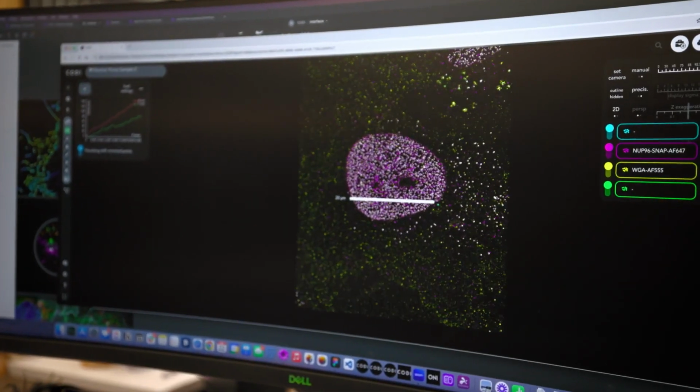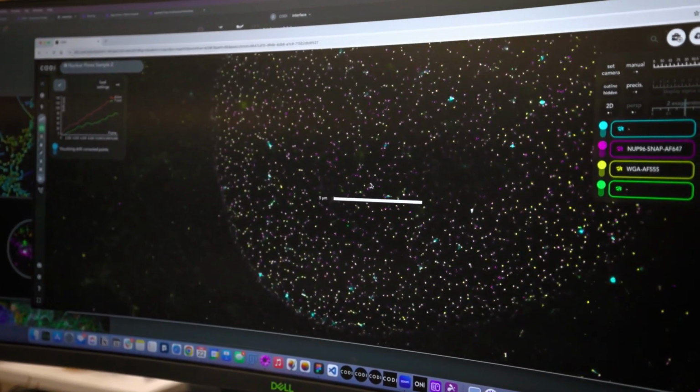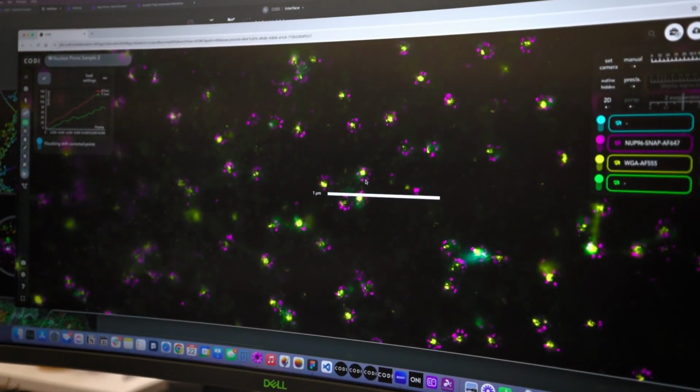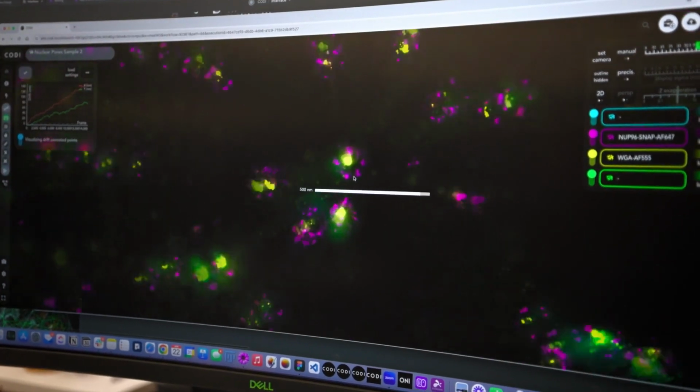So some of the ways this has made an impact is when you're looking at things like macromolecular complexes within a cell, where previously you might have basically seen what amounts to one giant blob. Now, when you look with super resolution, you can see all of these different subunits that are actually making up this complex as a whole. And what this also allows researchers to do is they can individually knock out different components of that and see how it affects an organism or a cell as a whole. So this level of detail allows you to not only investigate where things are spatially, but also allows you to get more information about what the actual function of something like a subunit within a complex does.